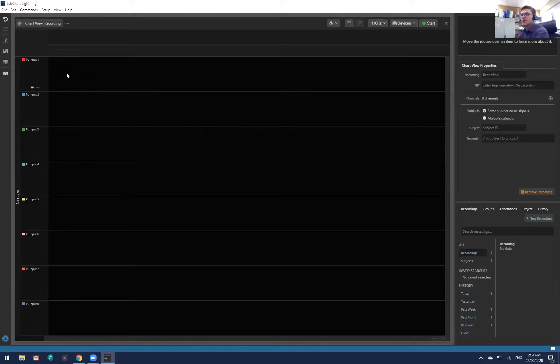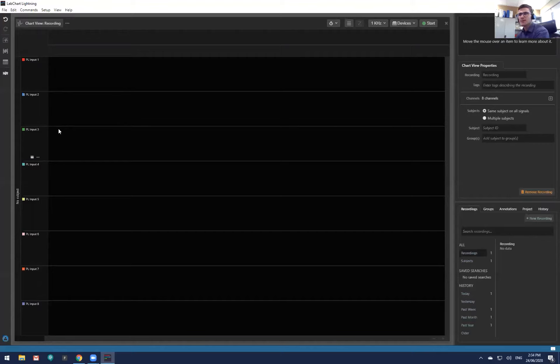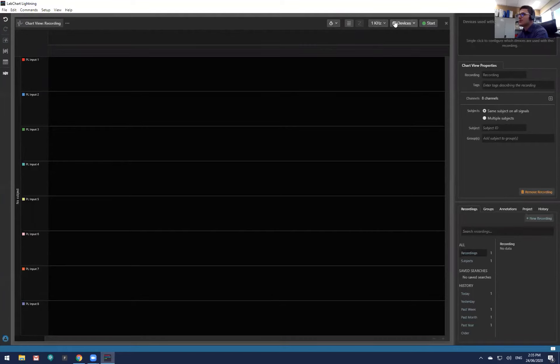The way Lightning works is that the channels correspond to how many inputs you have on your PowerLab — mine has eight channels and eight signals. But these signals can be moved anywhere you like; you don't have to keep them under one channel, which is vastly different from LabChart 8. Later in the webinar, I'll be superimposing data together — whether raw or calculated — to make it easier to see trends. As we have the device connected, you'll notice the Start option is now available.